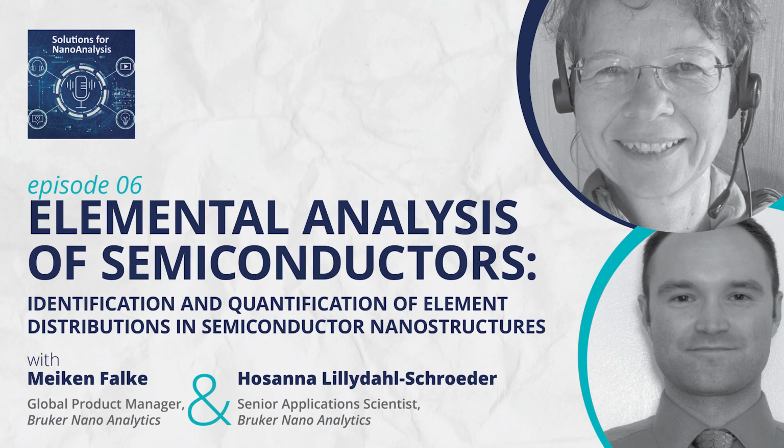Oh, that's quite a broad question. So I started out with TEM. So the length scales there, we are now at, I don't know which node, but it's always, we are talking about a few nanometers. So if we want to judge the functionality of the devices on the nanometer scale, we need to analyze at least one order of magnitude better.